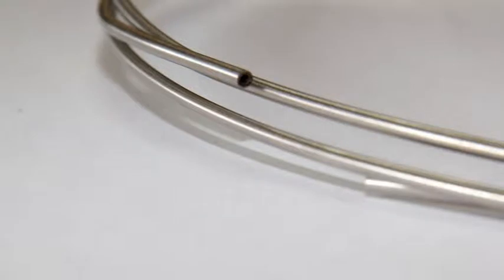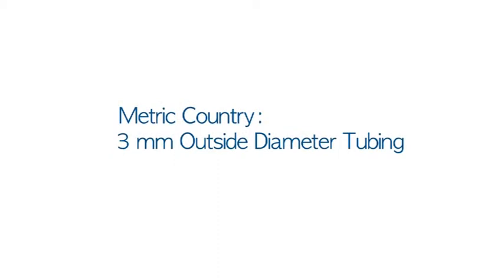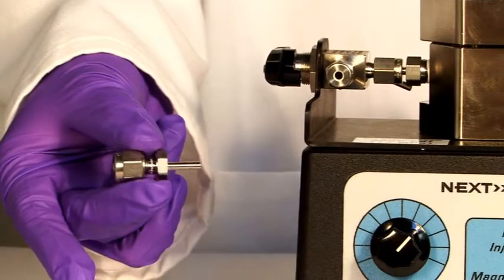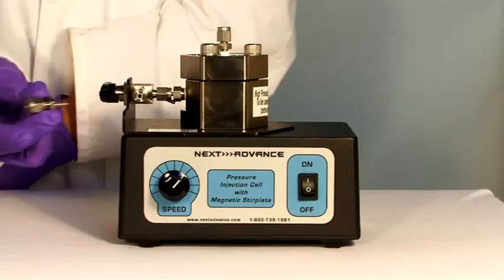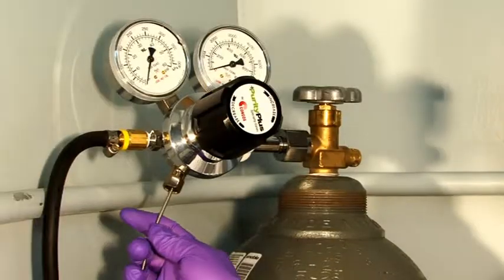In the United States, eighth-inch outside diameter tubing is standard and your pressure cell is already equipped with the proper fittings. If you're in a metric country and want to use three-millimeter outside diameter tubing, use the three-millimeter to eighth-inch adapter to connect the tubing to the pressure cell inlet.